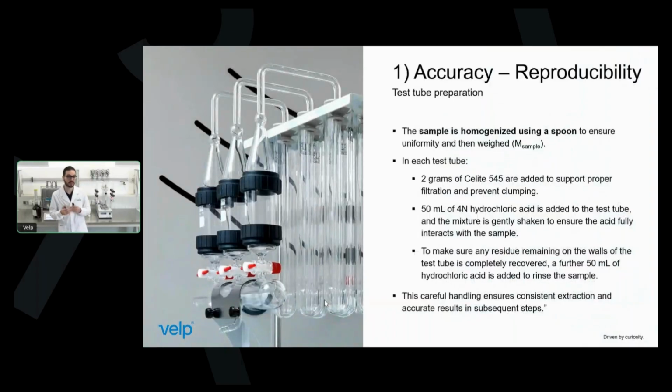With this technique we can analyze both liquid and solid samples. It's really important, as for the direct extraction, to have a homogeneous sample.